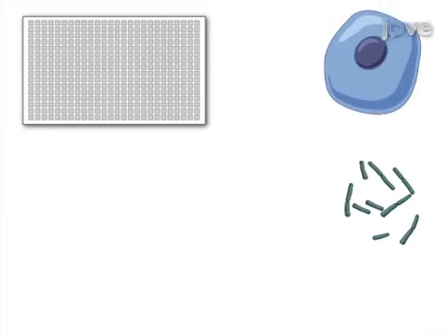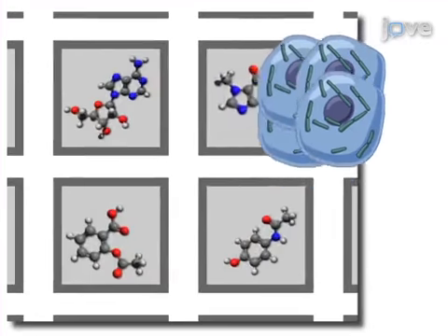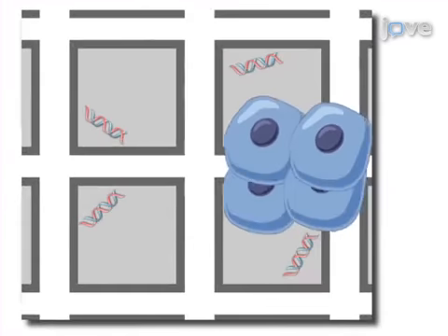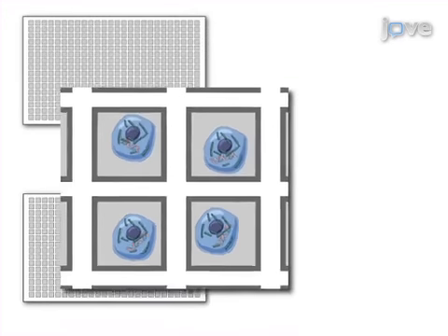The next step is to infect cells with green fluorescent protein expressing Mycobacterium tuberculosis, or GFP-MTB, add cells to the small molecule containing wells, and incubate the microplate for 5 days. For the RNAi approach, add cells onto RNAi transfectant complex containing wells, incubate the microplate for 3 days, and then infect cells with GFP-expressing Mycobacterium tuberculosis.